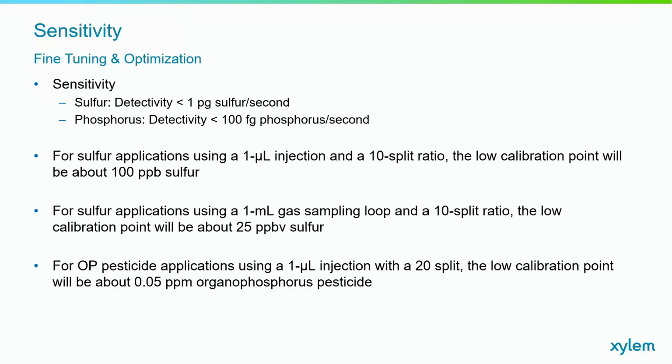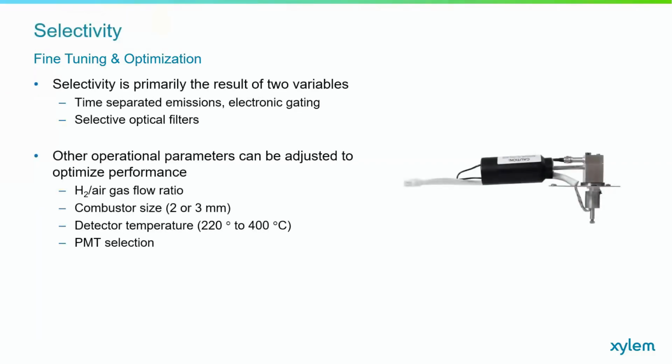So it's a very customizable process. That's why we list a detectivity limit, in particular on application notes, but providing a general detection limit is hard to do in some cases. It's just dependent on the application and everything else in the system.